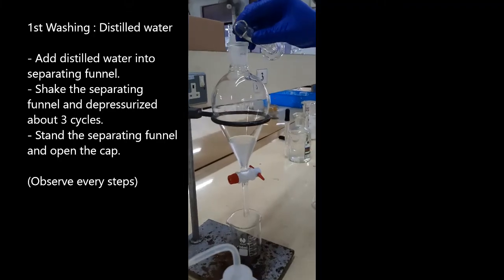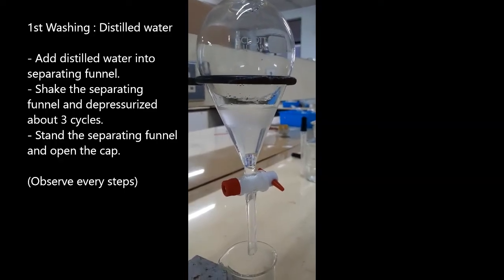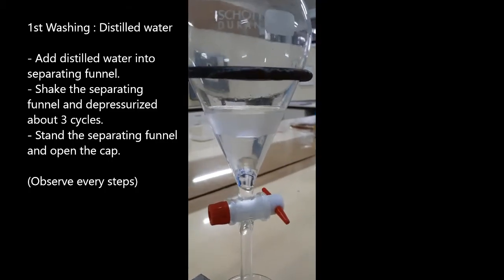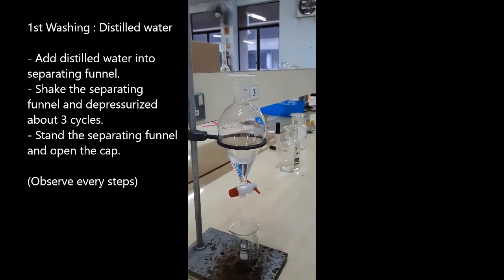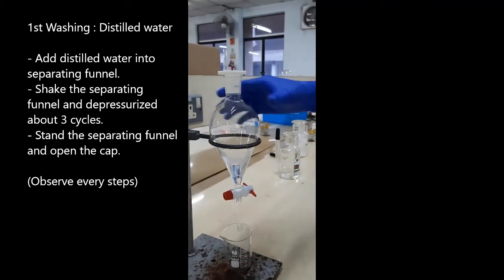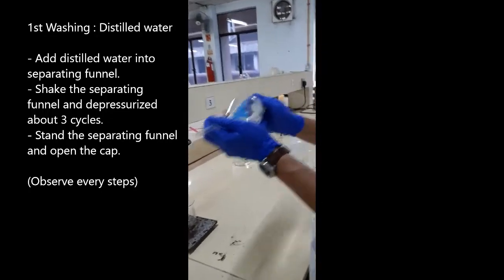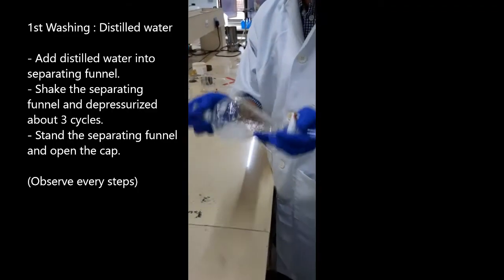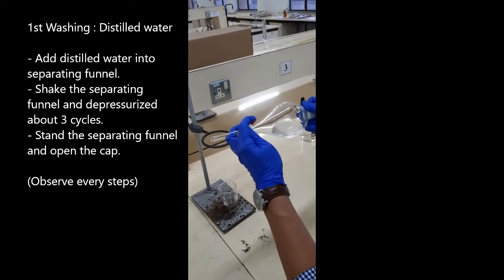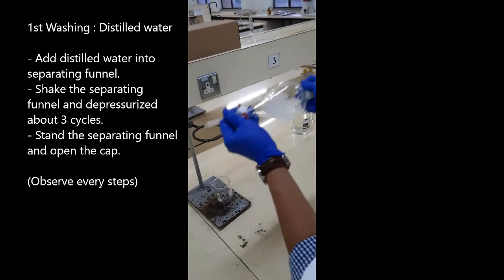Pour the distilled water into the separating funnel. Shake the separating funnel. After three cycles of shaking, release the air pressure in the separating funnel by opening the valves.